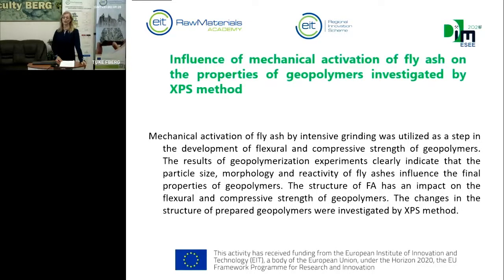The structure of fly ash has an impact on the flexural and compressive strength of geopolymers. The changes in the structure of prepared geopolymers were investigated by XPS method, and we confirmed the changes by this method.